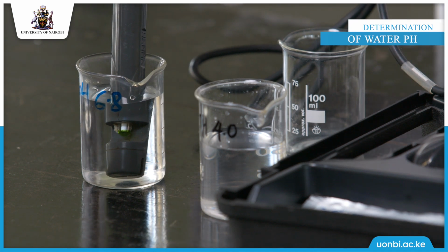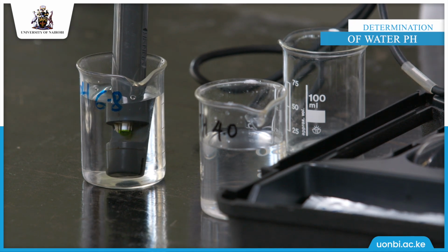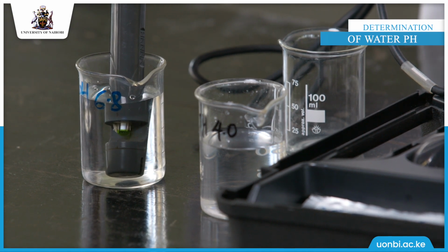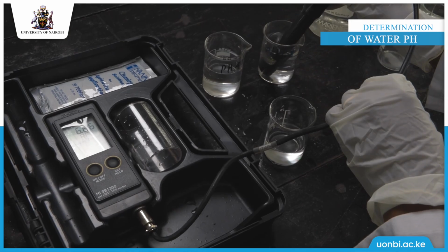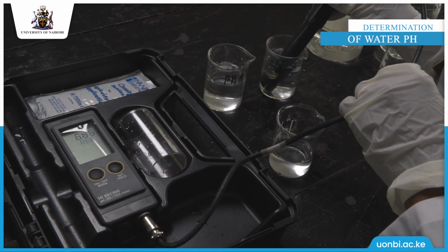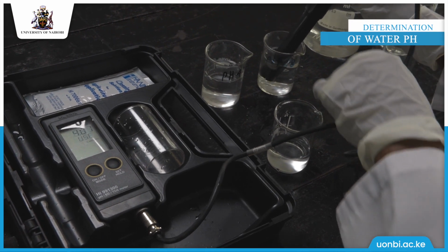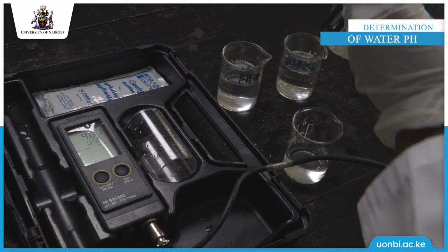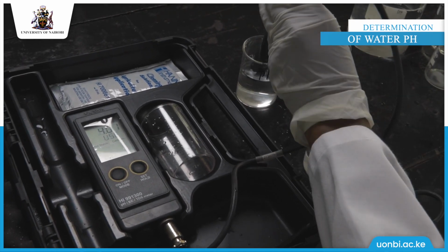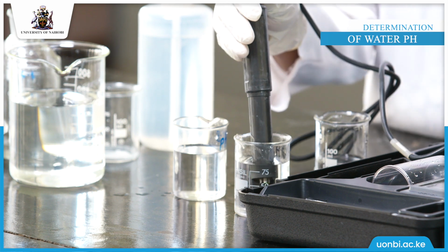After that, you insert the electrode into the next calibration standard. So the first one is okay. We rinse the electrode and insert it in the next one, which is 4.0.